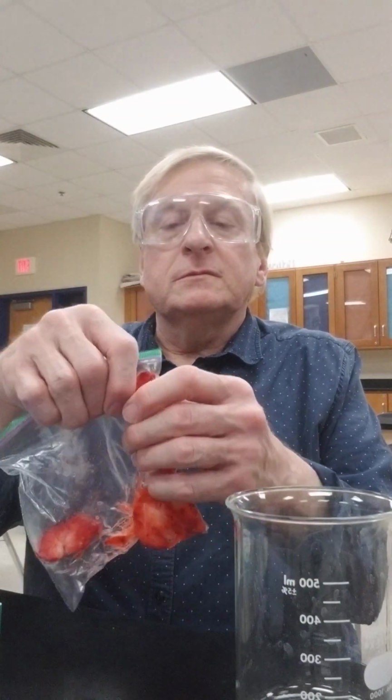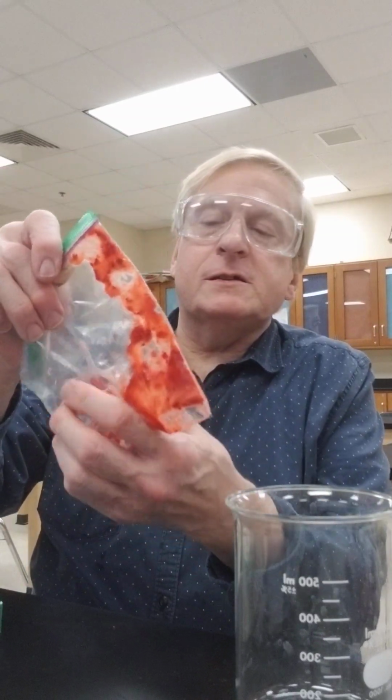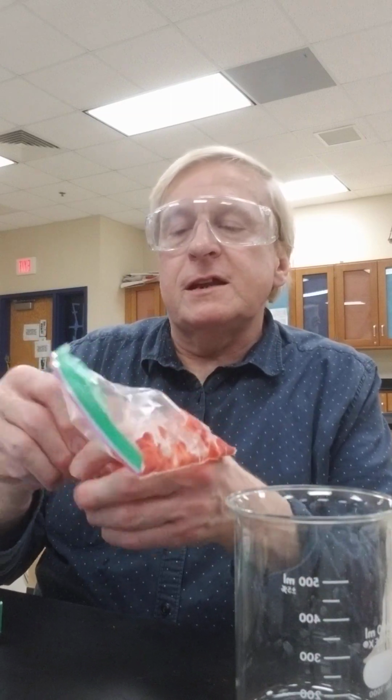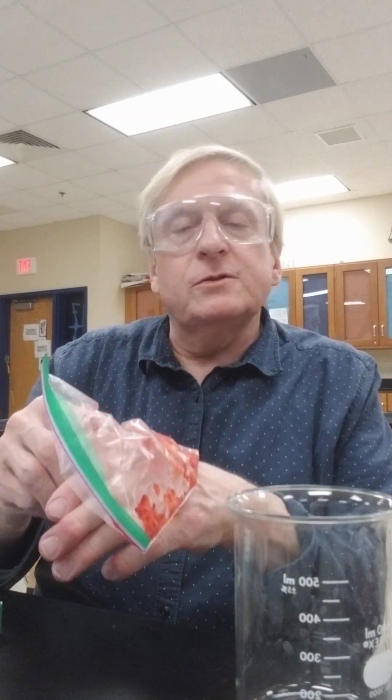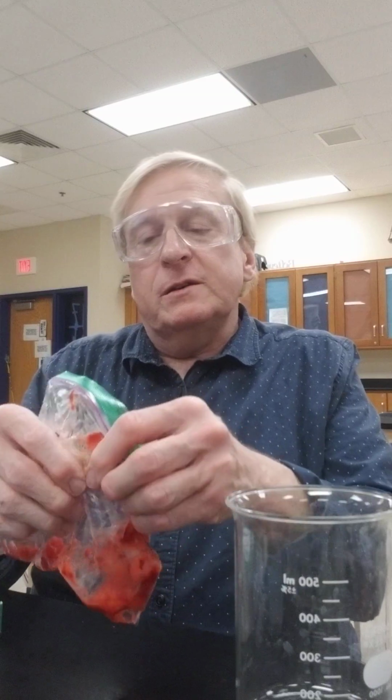The DNA is still there, however. Smashed up in a nice strawberry smash like this. Again, be careful you don't get these all over your clothes and stain a good shirt or good shoes or something like that. Yeah, that's my strawberry smash. I could probably do a little better and get that smashed up real good right there like that.